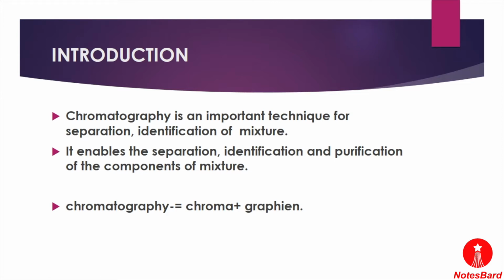Chromatography is used for the separation of different types of molecules from a sample mixture. The Russian botanist Mikhail Tswett coined the term chromatography in 1906. Tswett used this method to separate plant pigments, and that's why he named it chromatography. After that, the first analytical use of chromatography was by James and Martin in 1952, who used gas chromatography for the analysis of fatty acid mixtures.